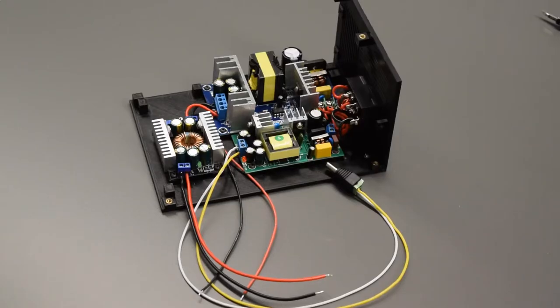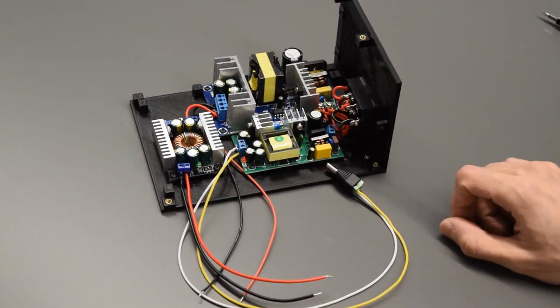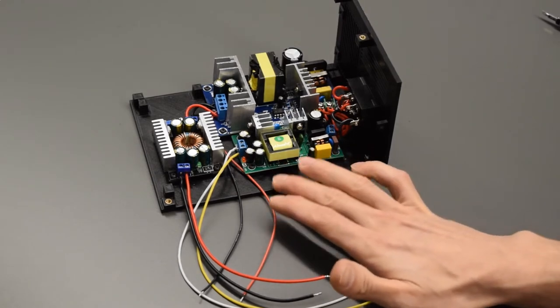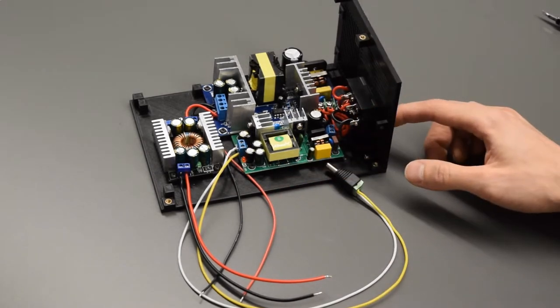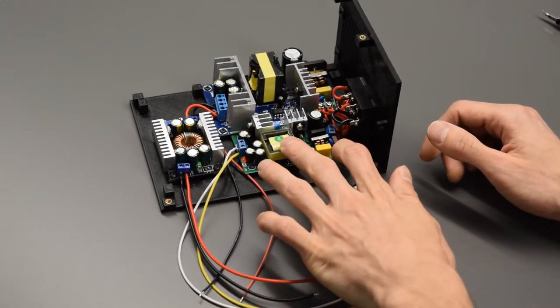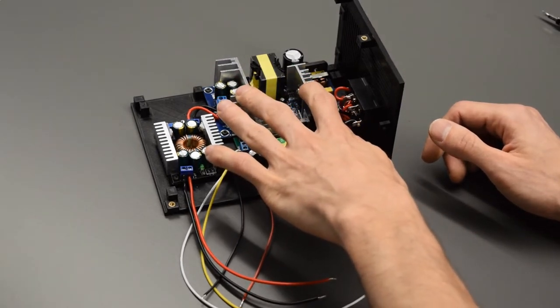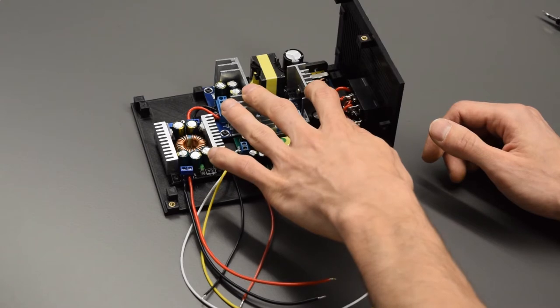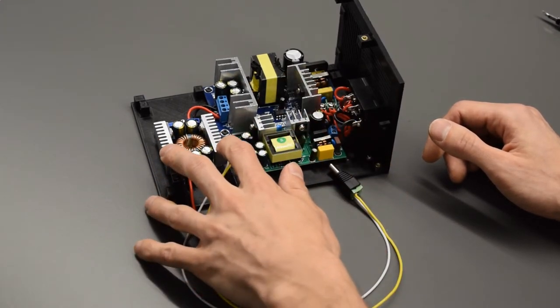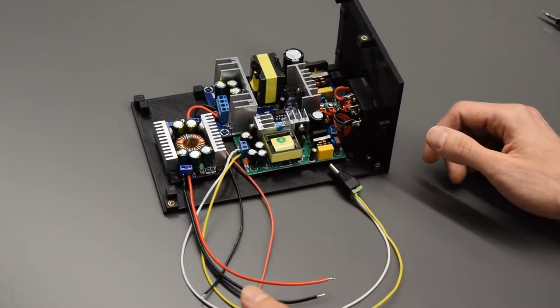All right, so once we have our walls all prepped with heat set inserts, we can go ahead and start assembling them. So the first section here is going to be the power source wall. This is the front wall and one of the side walls with the socket. We've got three different power source modules on here, the 5-volt 3-amp for the Pi. There's the 24-volt 6 to 9 amp that's rated for 6 amp, 9 max. The buck step-down converter over here, so this one's going to take our 24 volts, bring it down to 12 volts for some parts of the system.